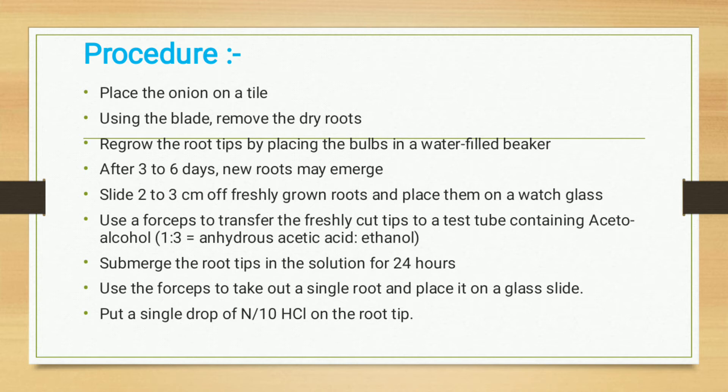Use forceps to transfer the freshly cut root tips to a test tube containing aceto-alcohol, which is a 1:3 ratio of acetic acid to ethanol. Submerge the root tips in this solution for 24 hours, so that whatever root tips are collected are fully immersed in the solution.